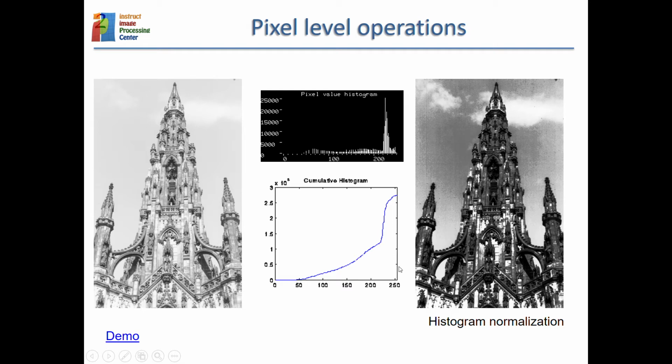result. And the result has a lot more contrast than the original image, and this is very much seen here in the cloud. So there was a cloud in the sky, but because it has so low contrast, so little difference between the pixel values in the cloud and the pixel values in the sky, we couldn't see the cloud clearly. But now there is much more difference between those values, and then we see the cloud nicely contrasted against the background. Okay, so let's see why that happened.